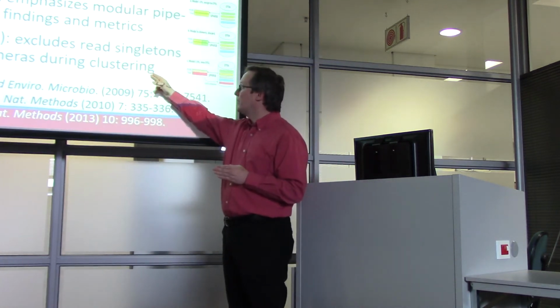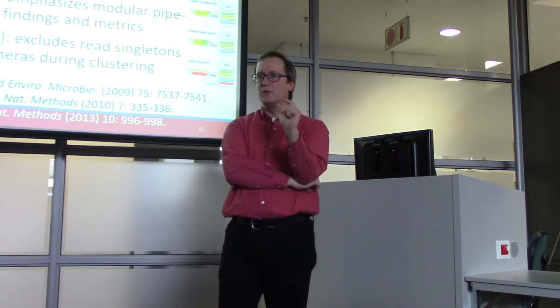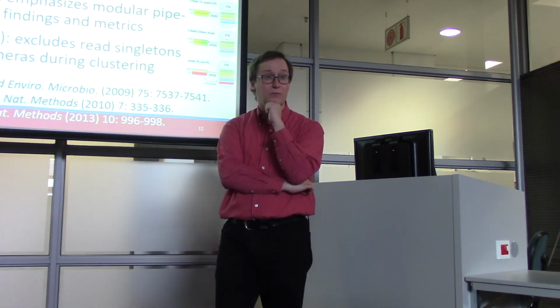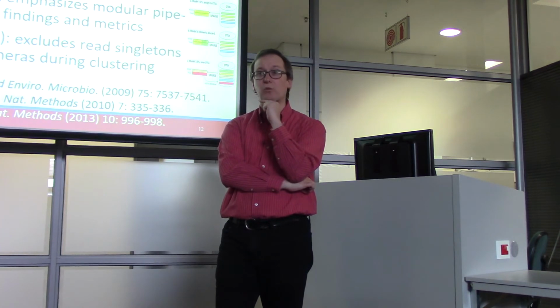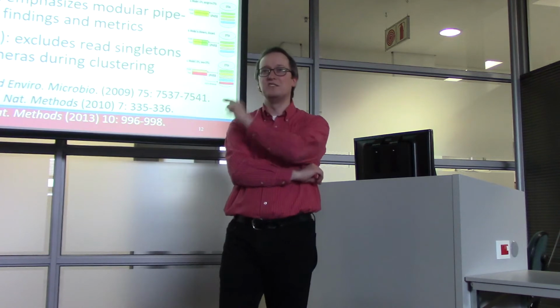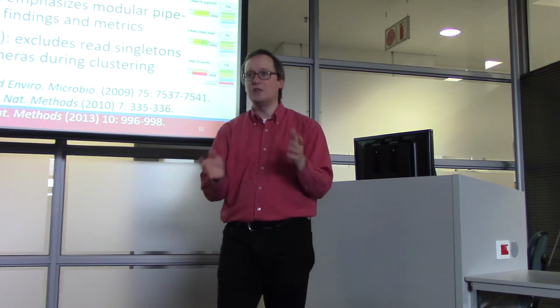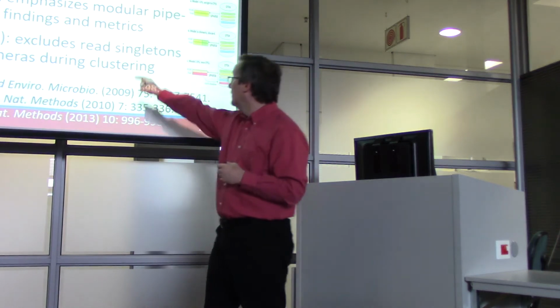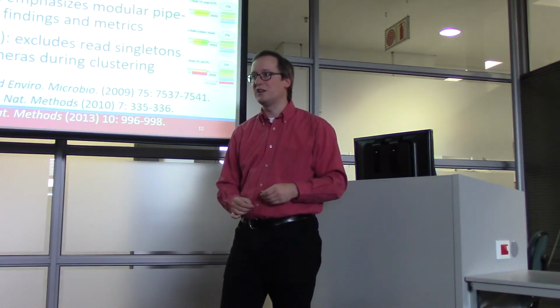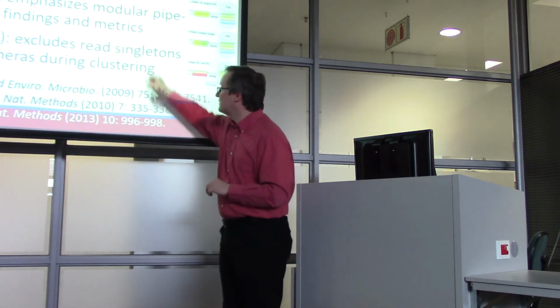But he had a very clear notion of what he wanted to accomplish. First off, he argued that a sequence that you see only once is not a sequence you care about. So if you have a single sequencing read, he says, this is noise, throw it out. If you have multiple copies of a sequence, then you can start to trust it. That's his view. So his histogram, we talked about that up on Mothur, remember? We had how many times each sequence had been seen. His solution is chop out any singletons, then start work. So that's the first part of UPARSE.